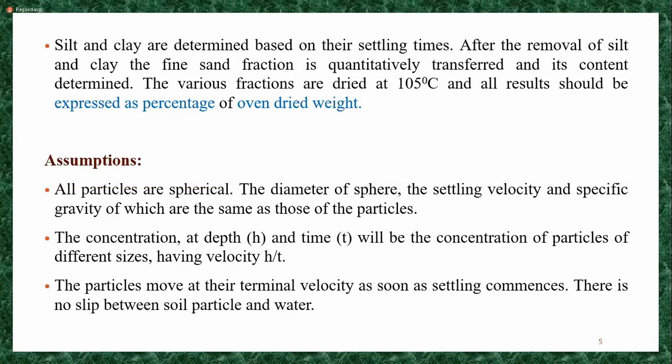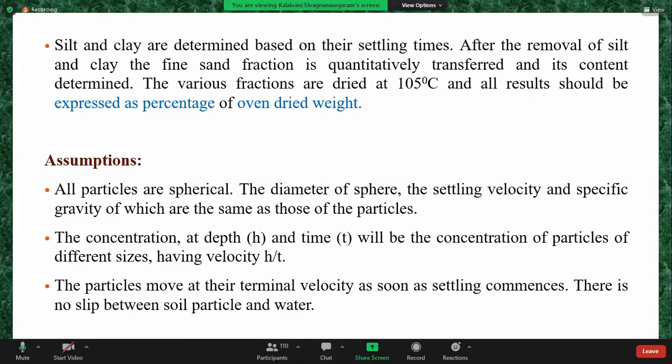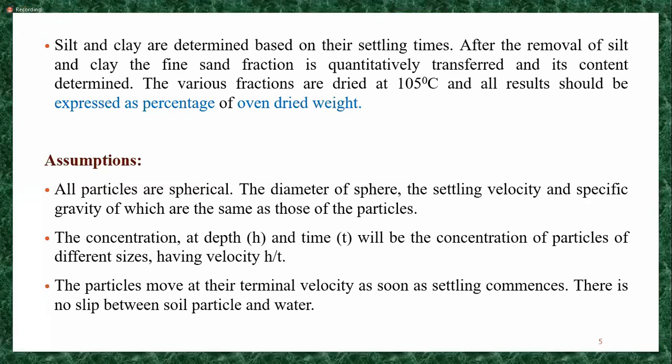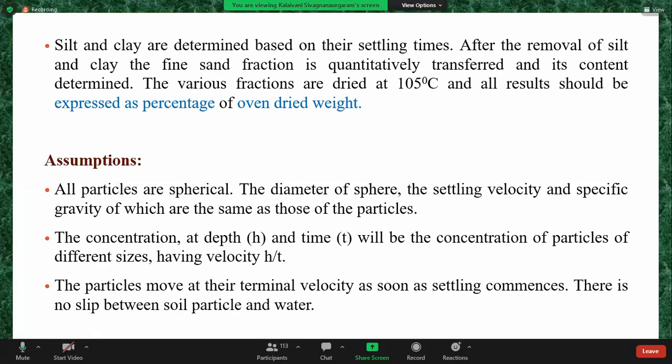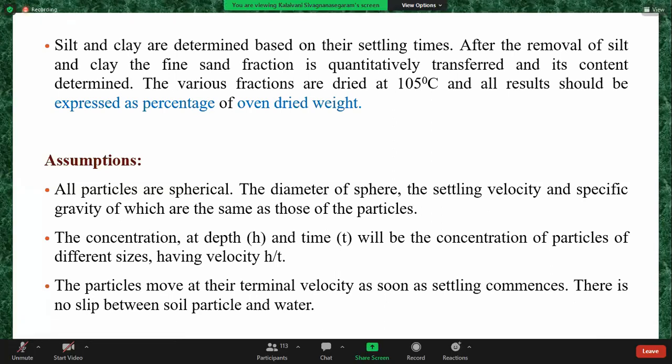Yeah, that one is also correct, but I'm asking about the basic assumption. Okay, constant temperature, very good. Then any other things? So why do we need to maintain a constant temperature? And just with temperature, right? Yeah, good. So any assumptions? Any other assumptions?